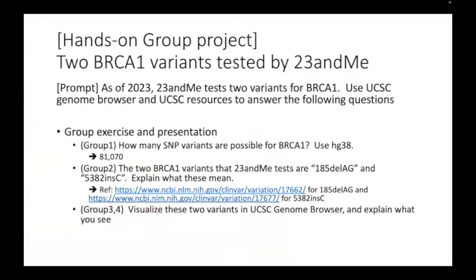So I actually explained all the technical details as well as those implications. My take-home message is basically, if you happen to do DNA sequencing or SNP testing, I want you to actually understand and fully explain it.